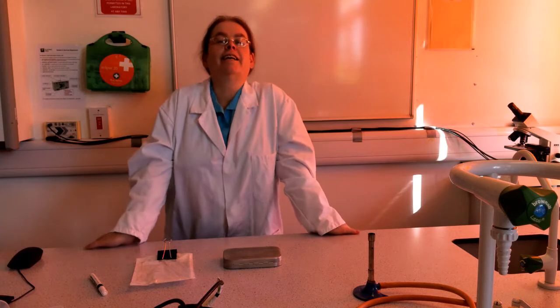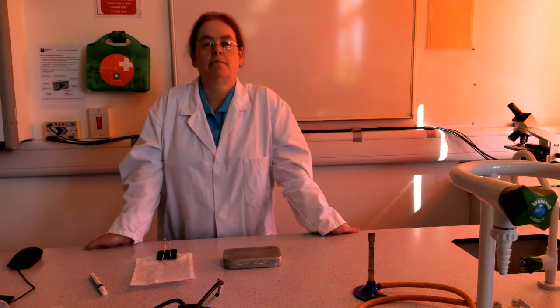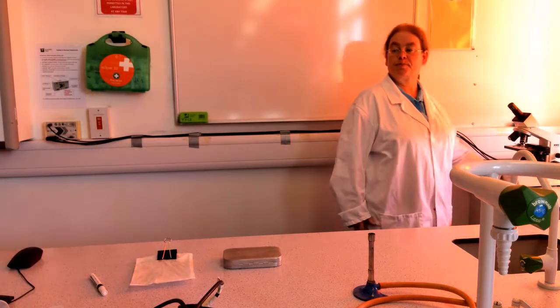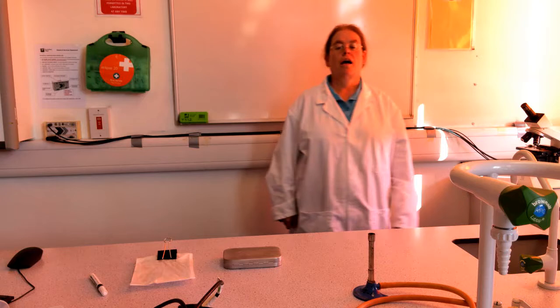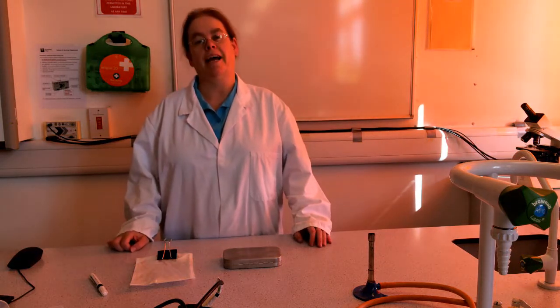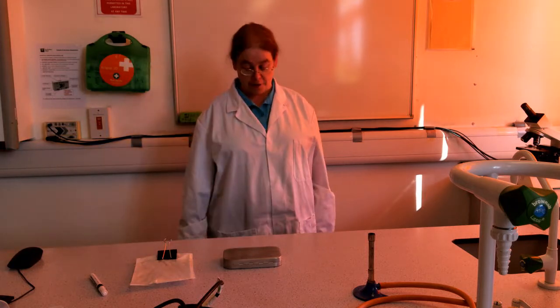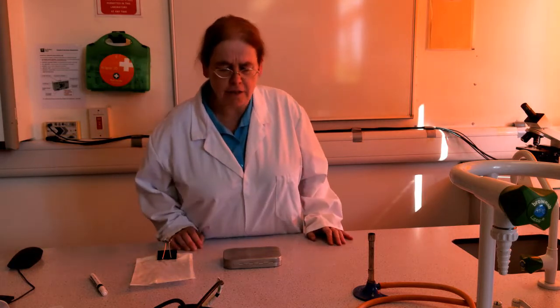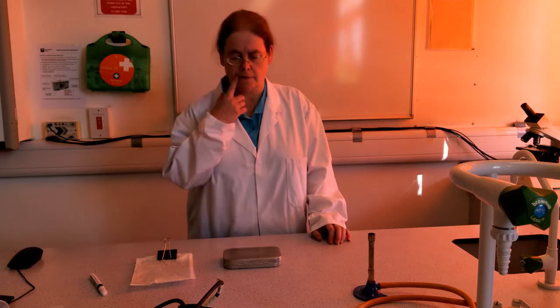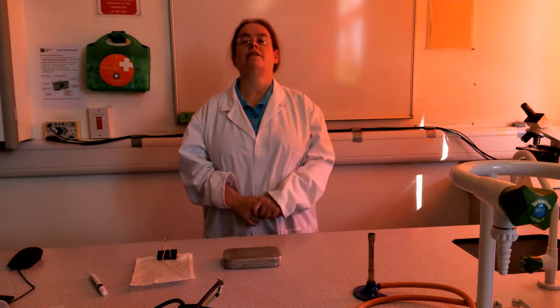And finally, and most obviously, you can just count them. That's what microscopes are for, after all. Put your bacteria on a slide, peer down the microscope and count them. Not actually as easy as it sounds. For one thing, looking down a microscope and going, oh, there's lots down here, 1, 2, 3, 4, I counted that one, is more difficult than it sounds.